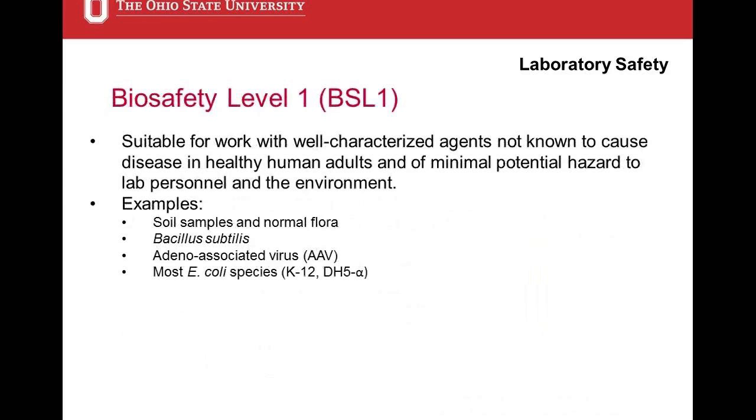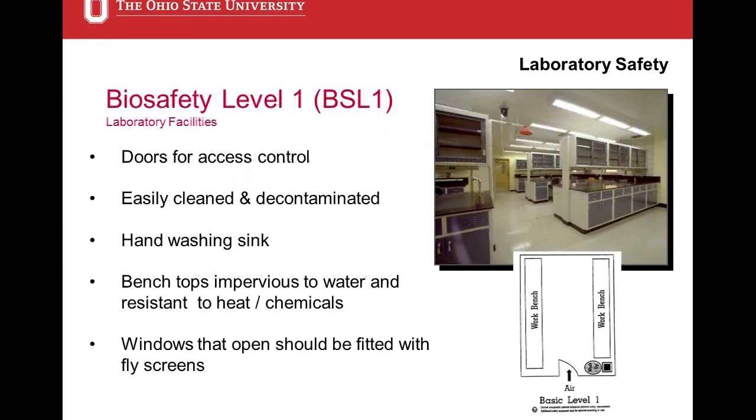A biosafety level 1 lab is pretty basic. This is your basic microbiology lab, okay? It's usually an open workspace with multiple lab benches. You've got doors. These are the requirements. You have to have a door, okay? You can't have an open entranceway to a public lab or a public hallway. So you have to have a door for access control.